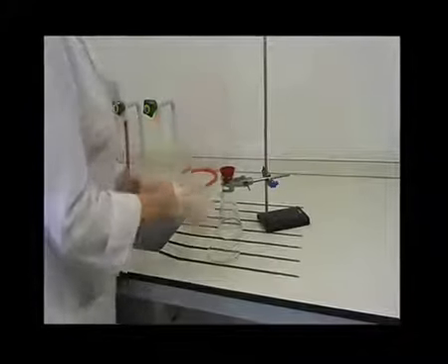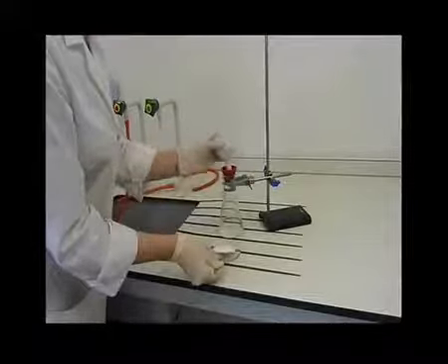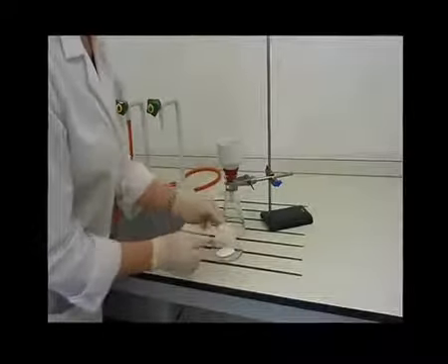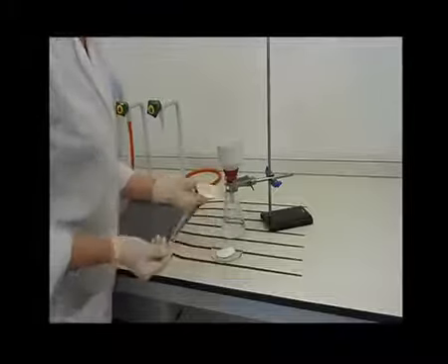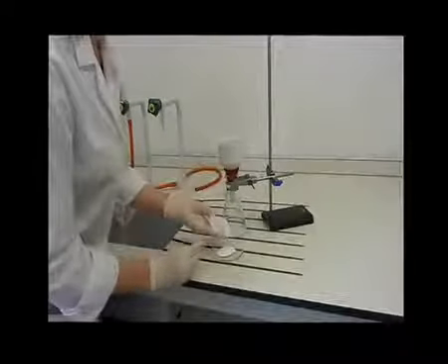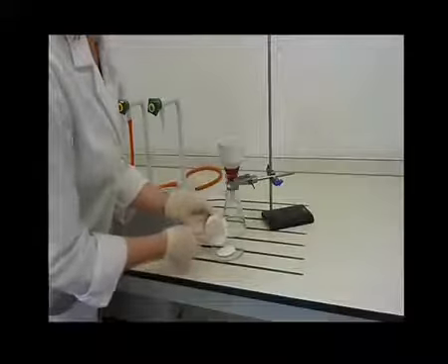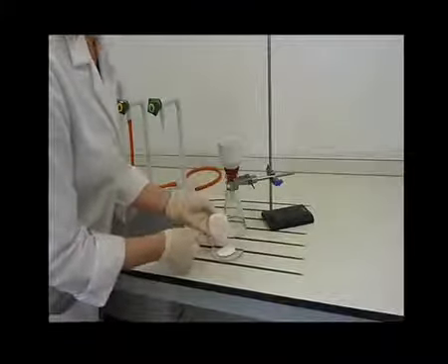Carefully transfer the solid to the pre-weighed watch glass or specimen vessel. This can be easily done by gently lifting the filter paper with the solid and placing it upside down on the watch glass. Peel away the filter paper. Check the filter funnel to ensure that the entire product has been collected.